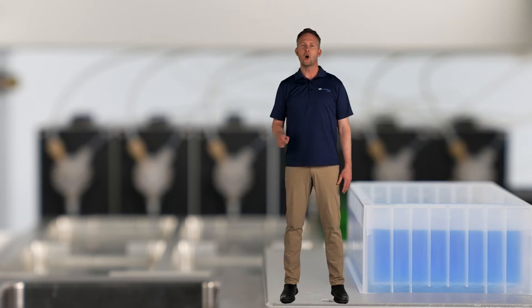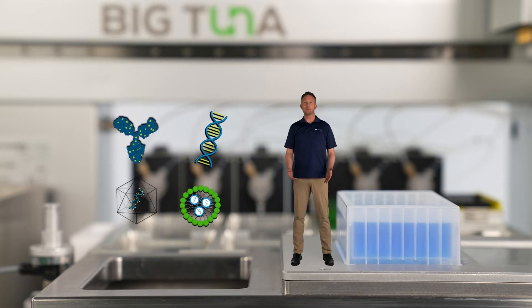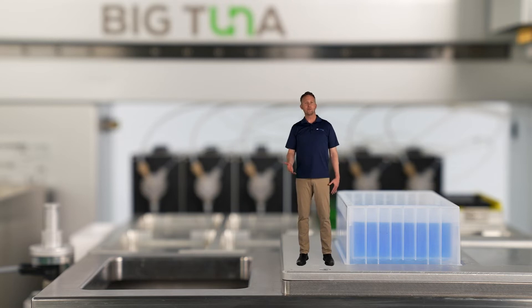Big Tuna uses a modified ultrafiltration-diafiltration method to process up to 96 samples in parallel using a plate-based format called the Unfilter. Its ease of use and versatility lets researchers fly through Buffer Exchange and concentration for sample prep of proteins, monoclonal antibodies, nucleic acids, AAVs, and lipid nanoparticles, with very little setup time and tons of process control.